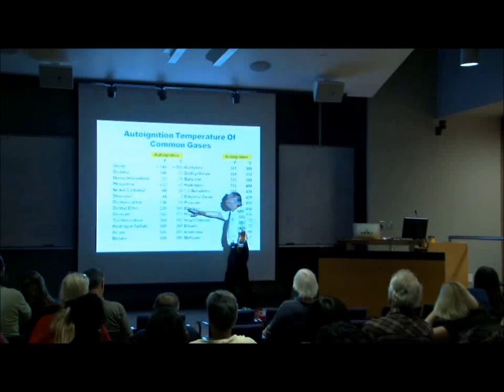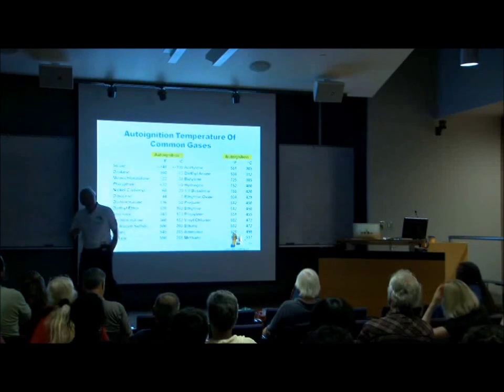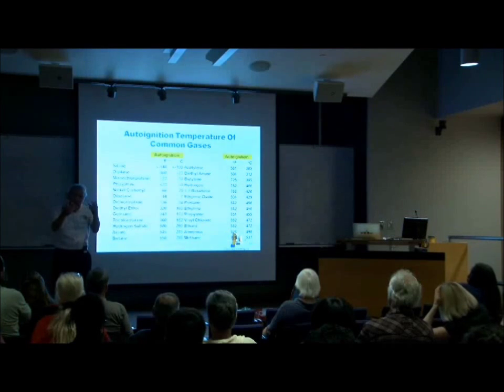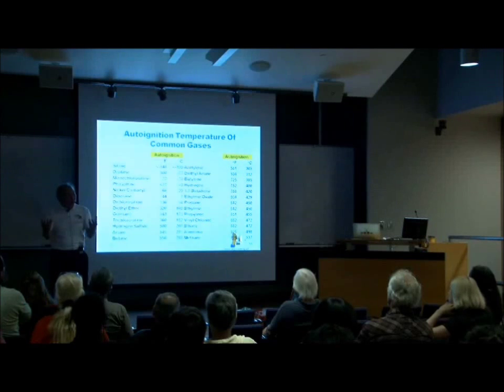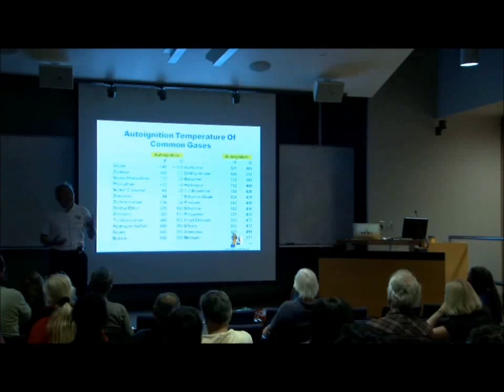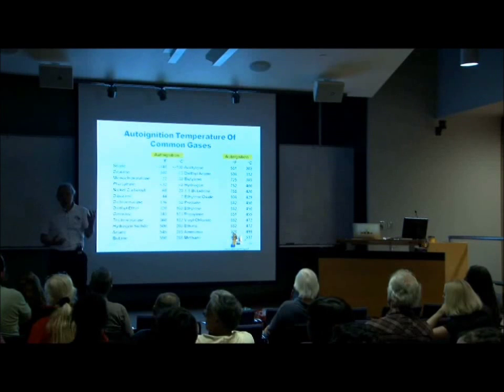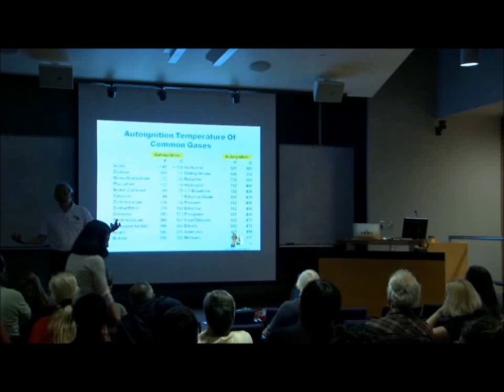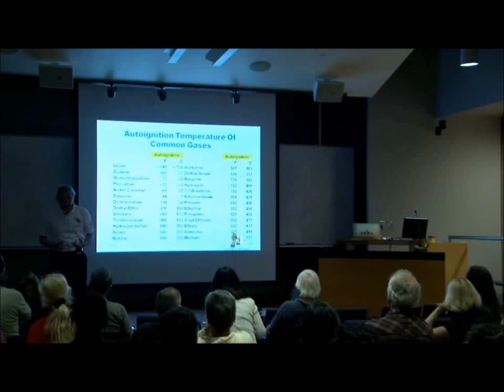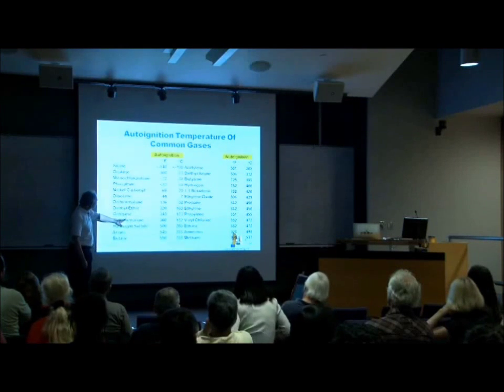Now, there are what we call self-igniters. Dichlorosilane, for example. What happens with dichlorosilane is when it releases into air, it reacts with the moisture in the air to become HCl. It's an exothermic reaction. The heat that reaction causes goes back into the molecule, and it then heats it up to the autoignition temperature, and the dichlorosilane will ignite. Okay, you can create conditions in which the material will ignite.